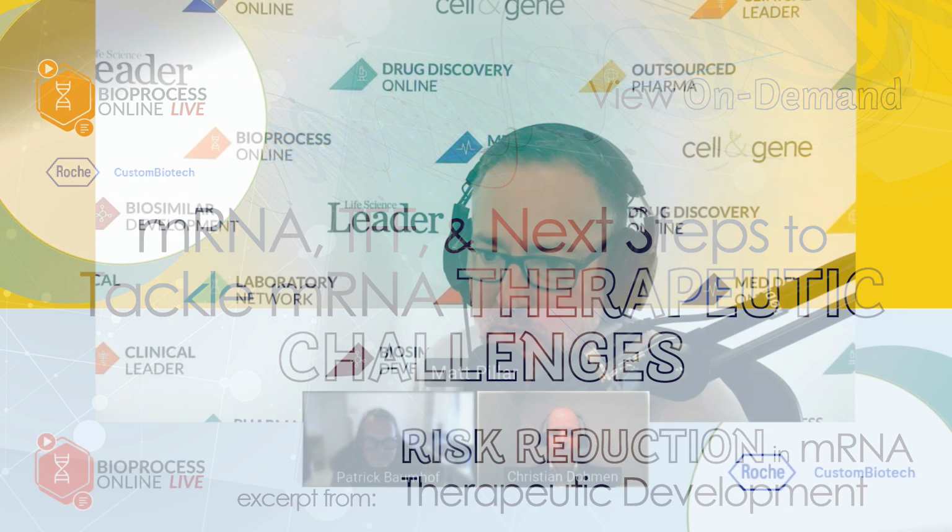Can you offer any more on what that lyophilization at room temperature paradigm that you mentioned looks like? And then a related question from Sogra, what do you think of stabilizing the mRNA in films? I'm assuming that's related to TFF.